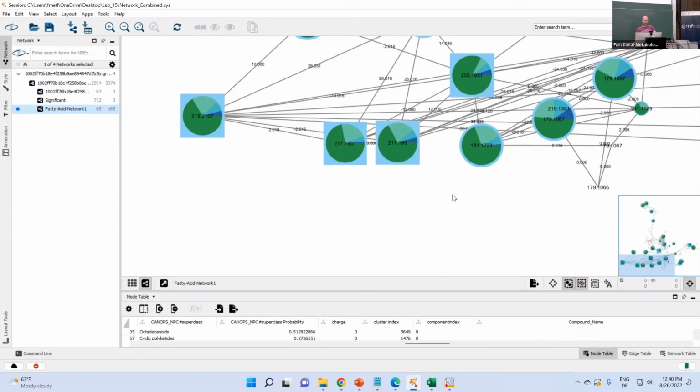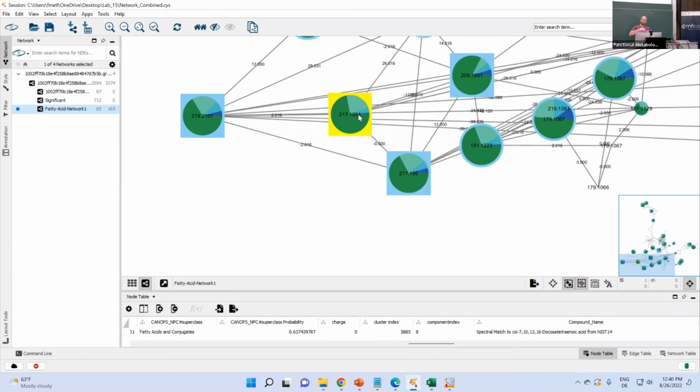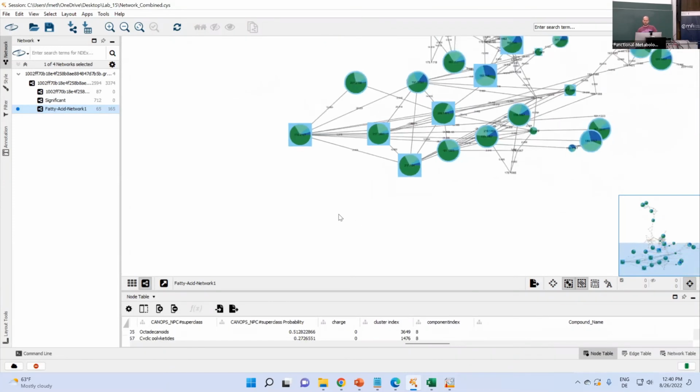But for now, okay, let's assume I go to the dashboard and they're truly 2 individual peaks, and that's a real thing. And maybe I also know that by chemical context this is a high fatty acid containing Synechococcus culture. And I want to showcase this now as one of the results in my paper.